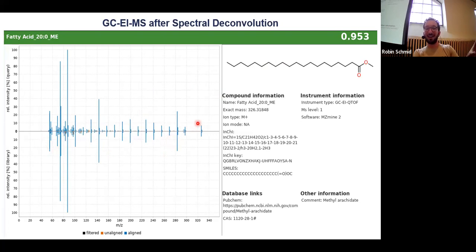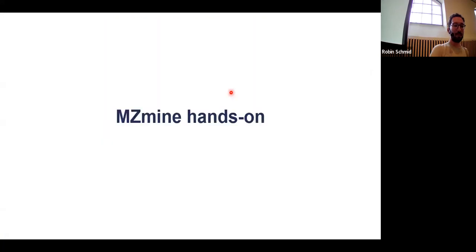The thing is, we see already that this is a fatty acyl methyl ester, because for GC we have to make it non-polar, and maybe it's an ethyl ester, right? I know this is most likely just because we needed to make it go into the gas phase. But in the matching, it's sometimes just slight changes when we elongate the chain, or make small changes on the structure. So sometimes it's good that in LC-MS at least we have the precursor m/z.